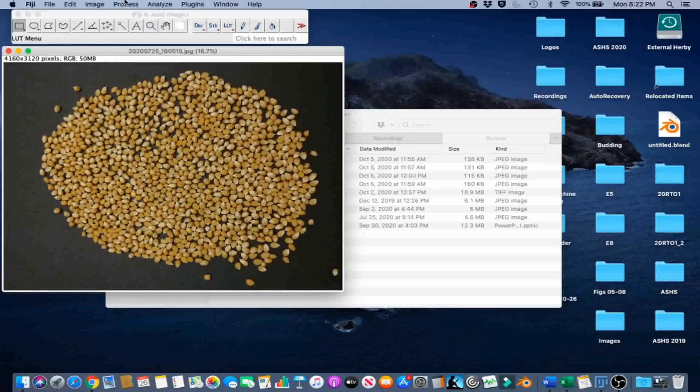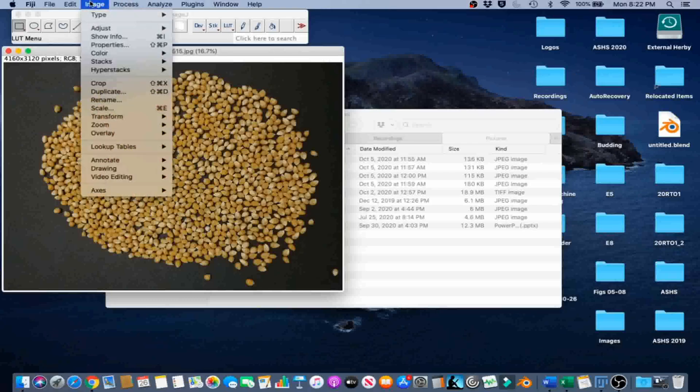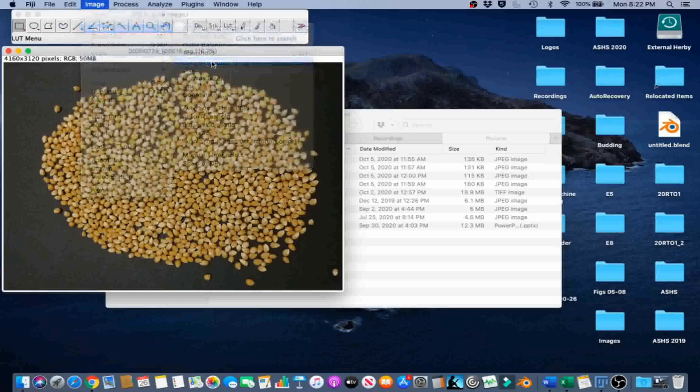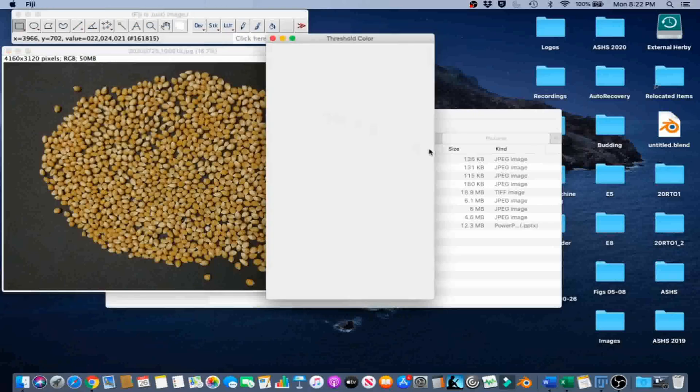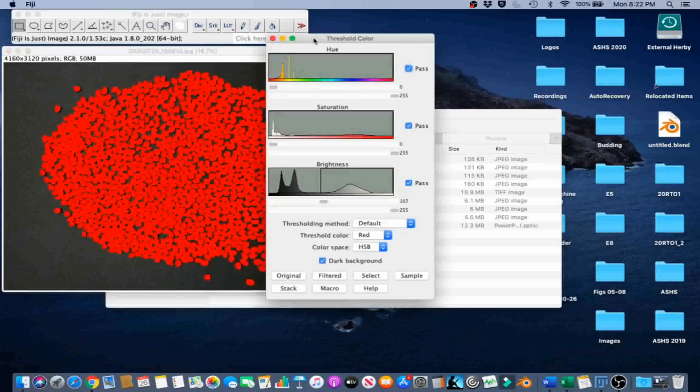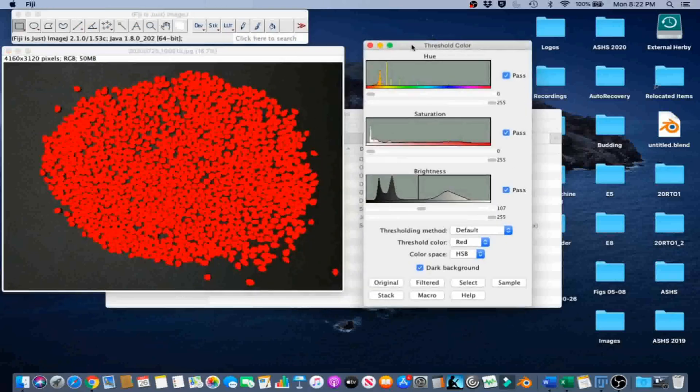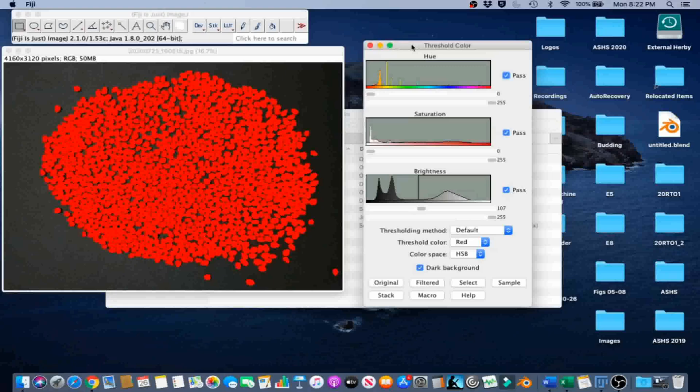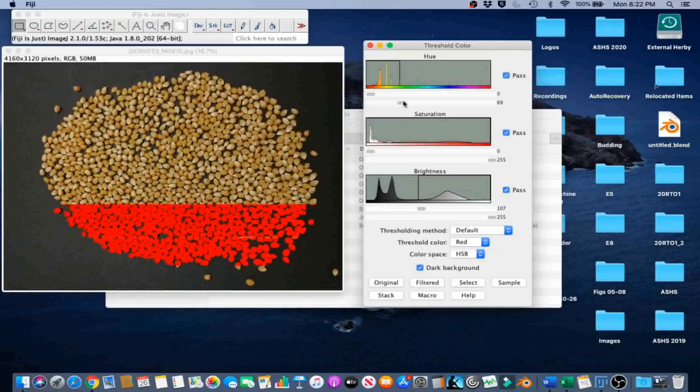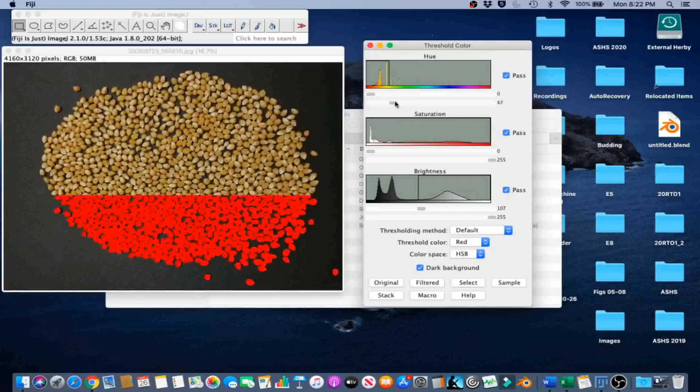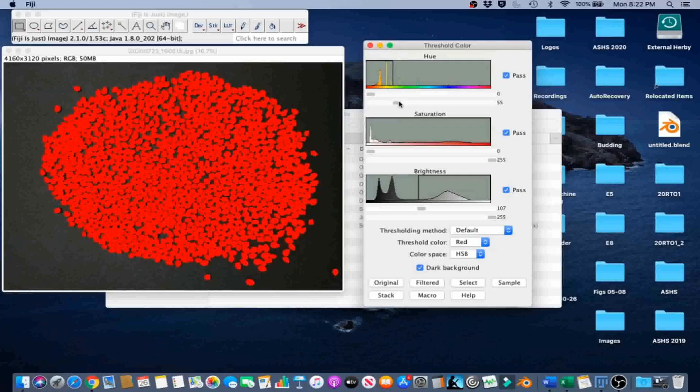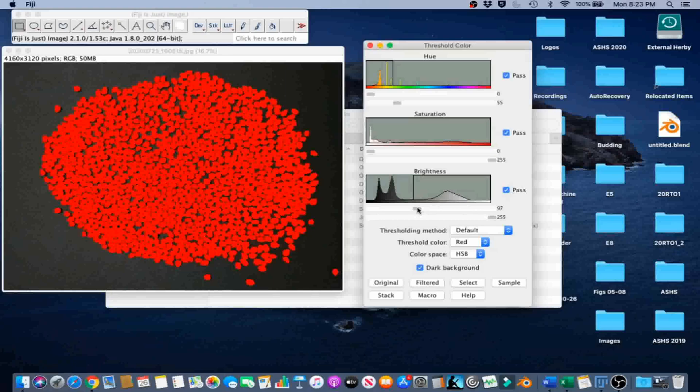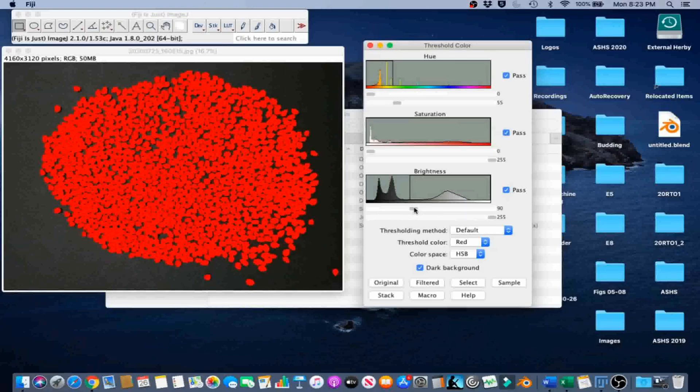Go to Image, Adjust, Color Threshold. In this case, a hue between 0 and 55, saturation between 0 and 255, and brightness between 90 and 255 works pretty great. Go ahead and select.